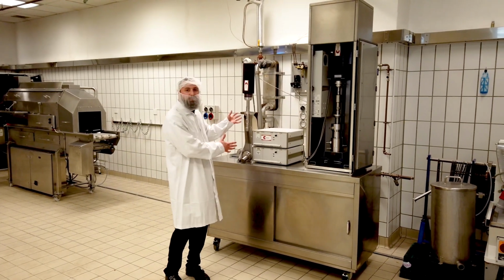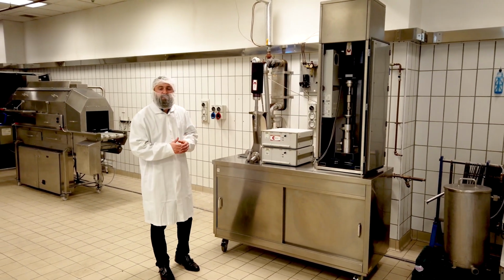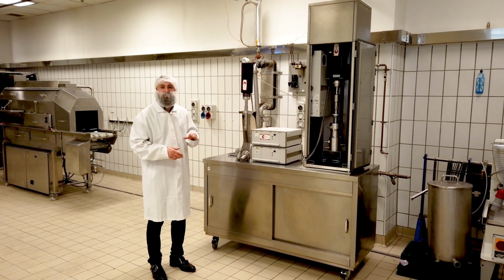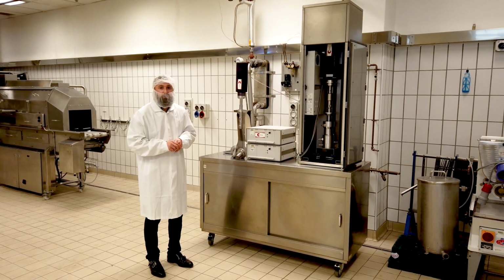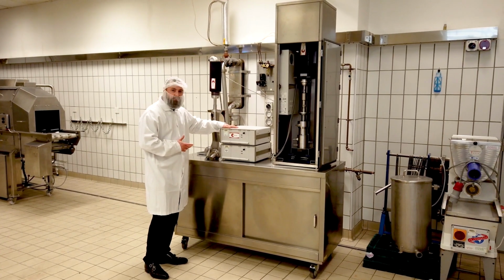This is our power ultrasound technology, and this technology uses sound waves in a liquid medium. And the beauty of this technology is it can be utilised in a wide range of applications. Power ultrasound can be used for defoaming applications, heat mass transfer applications, and it can even be used for improving extraction.